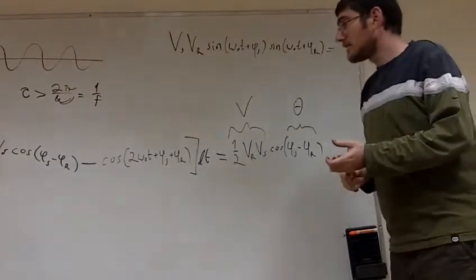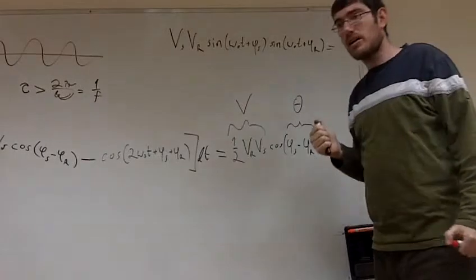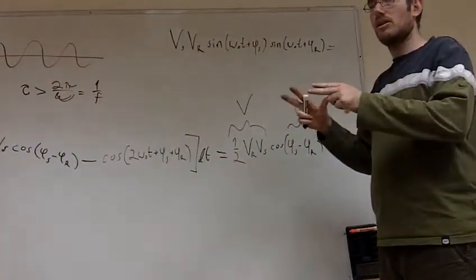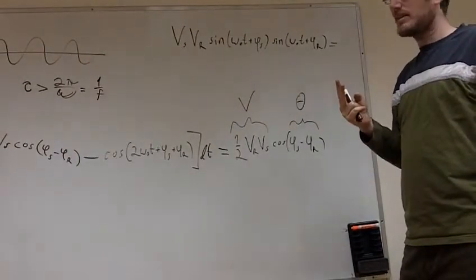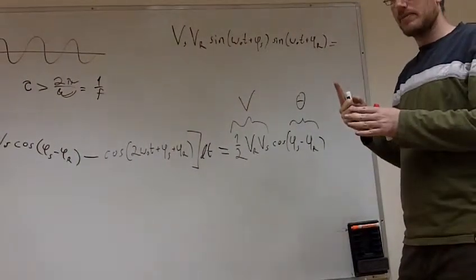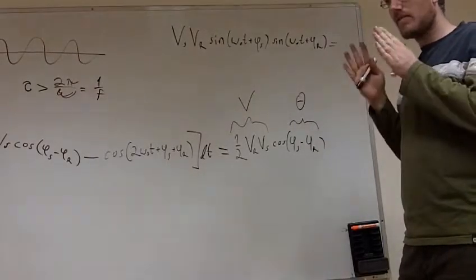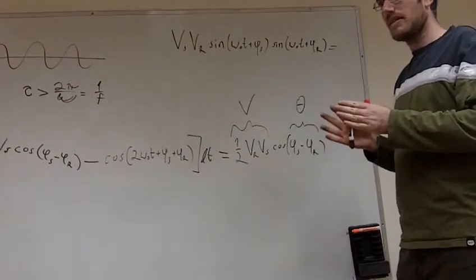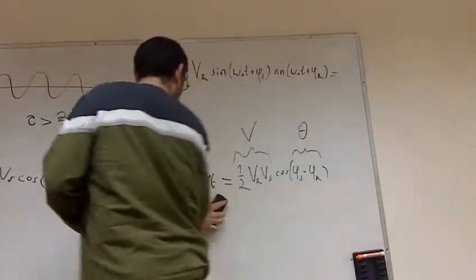Now, this is, as I said, a general lock-in. Our lock-in is inside the SPM controller. That's where the lock-in is. Until now we talked about one reference signal, but in our lock-in we have two reference signals. They both have the same frequency, but there's a phase difference between reference 1 and reference 2.